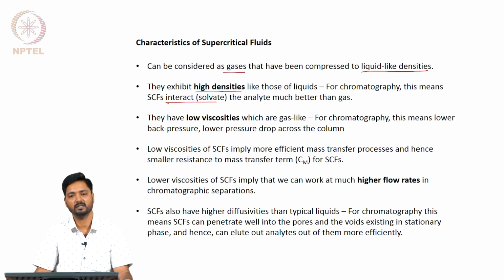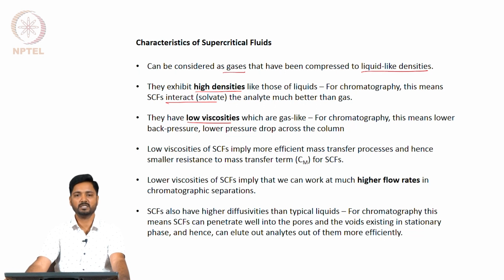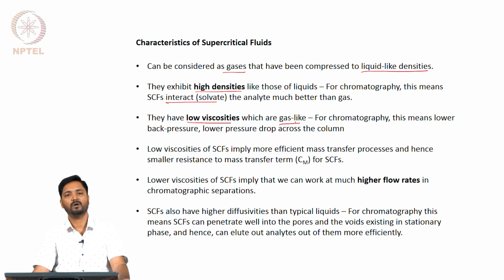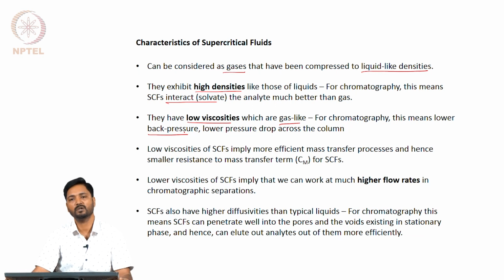Another aspect that is of use to us is that the supercritical fluids have low viscosities, and these viscosities are more like those of the gases, and for chromatographic utility this is an important aspect, because low viscosities directly relate to low back pressures being generated, because the resistance to the flow of this medium is much less.